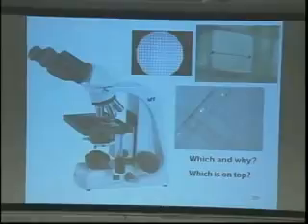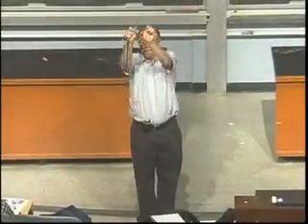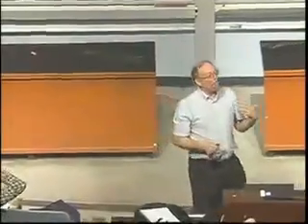So in fact, using optical sectioning, you can tell, so do you think this is hollow or solid? Hollow, because there's the edge, the space between edge. If I was at a different point on that hollow cylinder, those lines would get closer together, or maybe further apart where I'm at, right? If I go towards the top, those lines would appear to go closer and closer together, right? If I go to the midpoint, to the farthest part apart, as I go to the bottom, they get closer and closer together, right? So you can actually recreate the entire three-dimensional image by optically sectioning a specimen at different points in that specimen. Does that make sense? Sounds easy. It's much harder in practice, okay? So you'll do that a lot, okay?